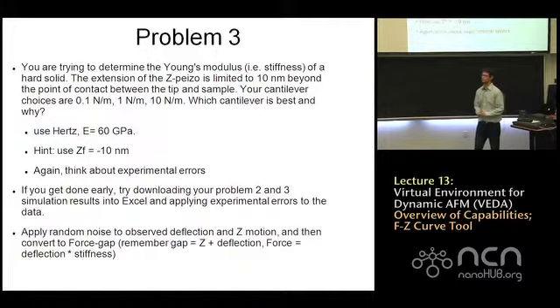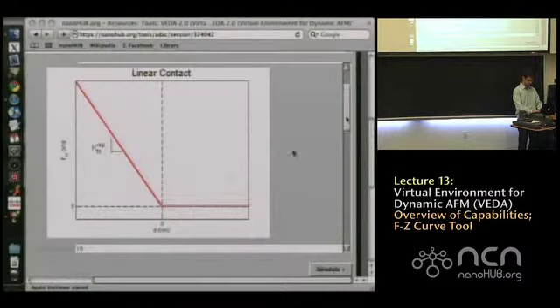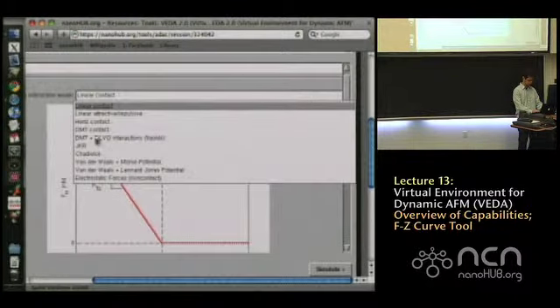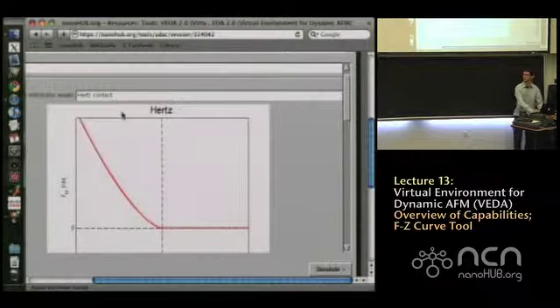And we'll do the three simulations for 0.1, 1 newton per meter, and 10 newton per meter cantilever. So use this model for your tip sample interaction.